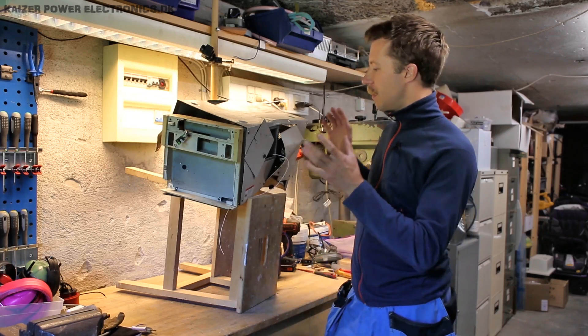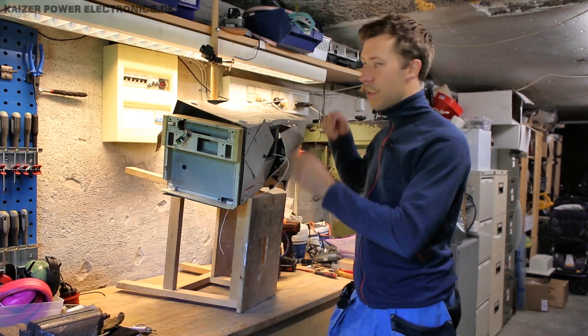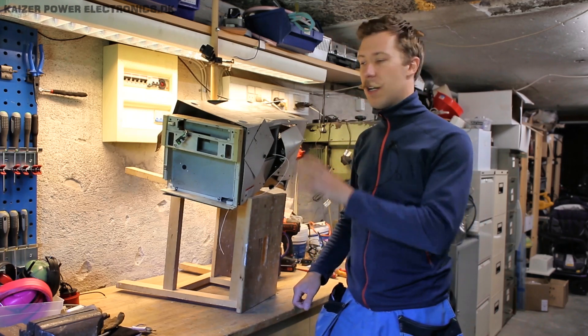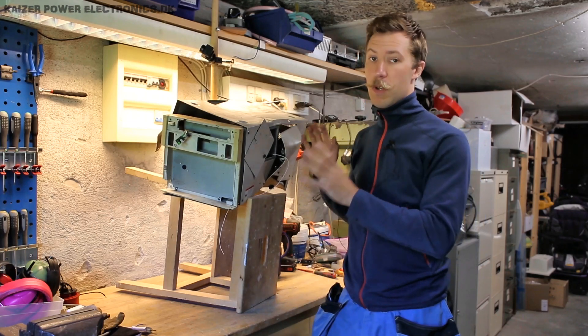As you can see, it is completely smashed up. But just looking through the different holes in it, it seems the electronics are pretty intact, and it is only the outer shielding that has taken some serious damage while this was thrown out.